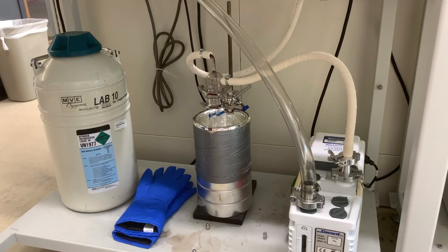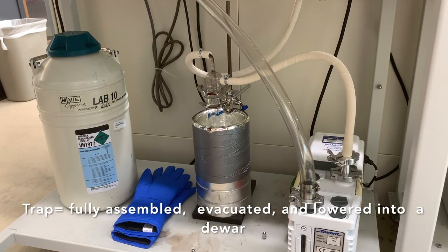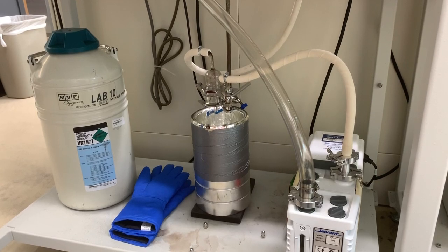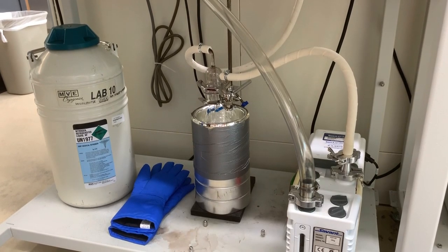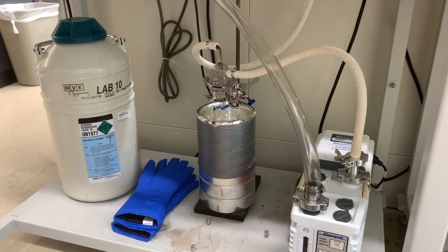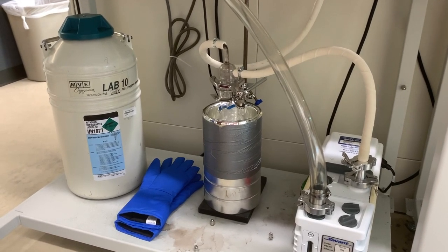What we see now is the trap fully assembled, evacuated, and lowered into a Dewar. This Dewar is made for holding liquid nitrogen, which we will be using to freeze out all the vapors that will evaporate into the vacuum system.